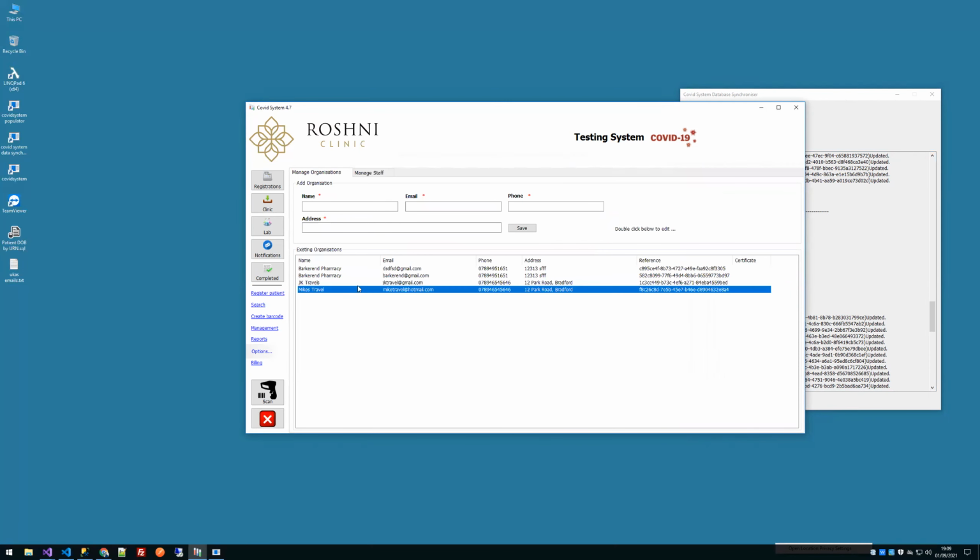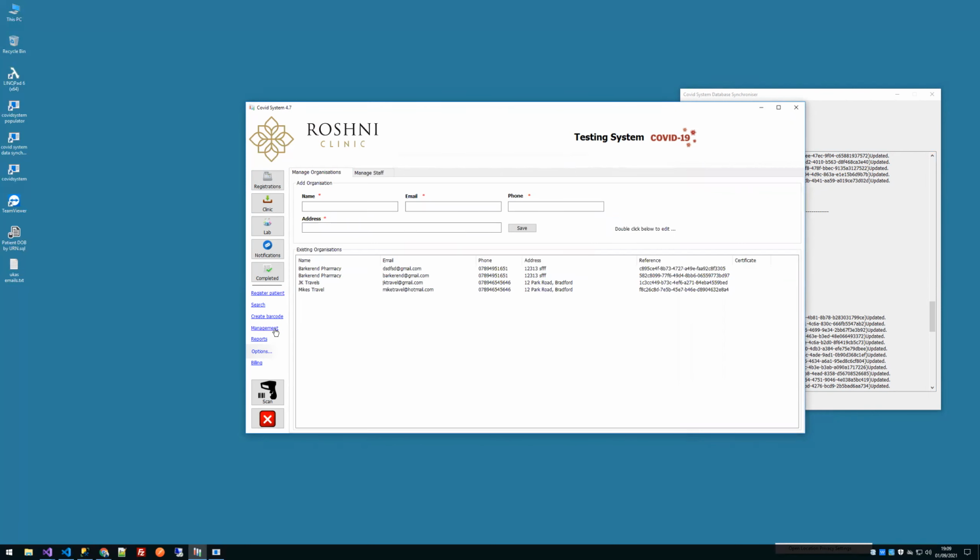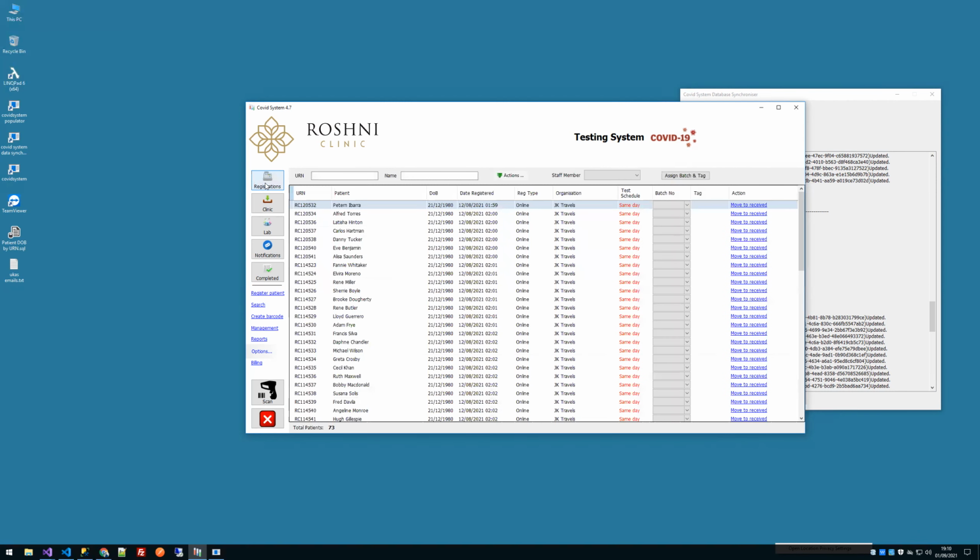Anytime they request certificates for their patients, it will be printed with their template. These are additional things worth mentioning. If you wanted to give more bespoke functionality to the people that bring the tests in, and who have access through the web portal, you could. That's the crux of it, without talking about stuff you don't need.